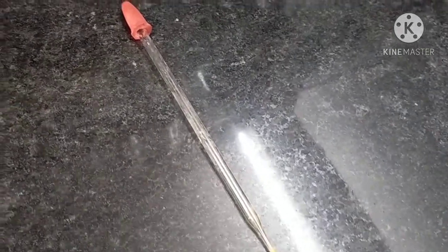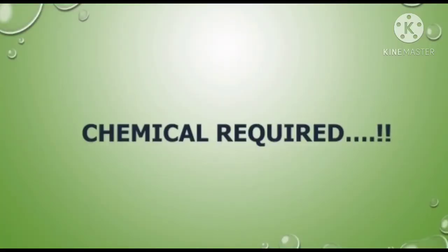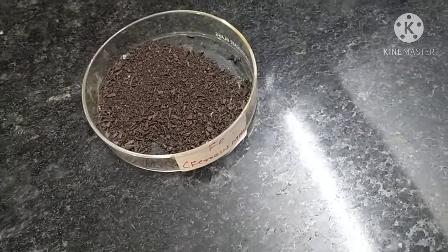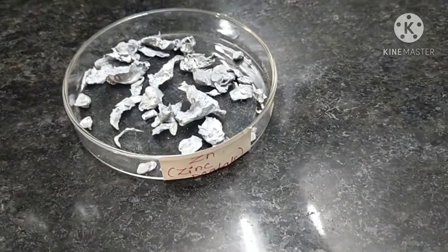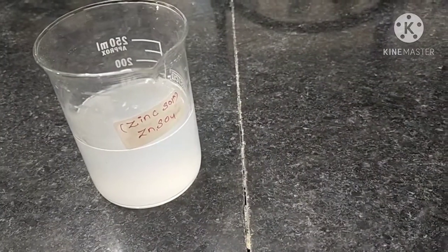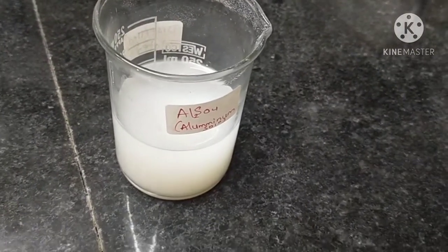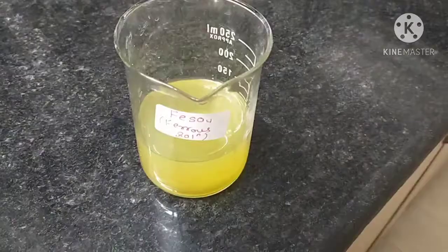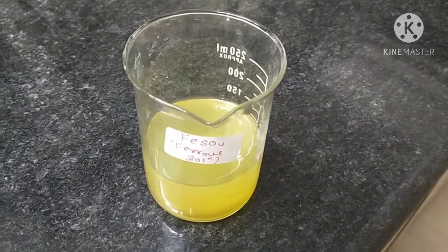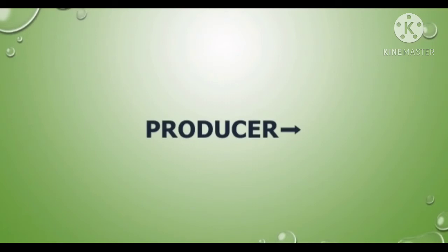To perform this experiment, the apparatus required are test tubes, a test tube stand, one beaker, a dropper, and one petri dish. The chemicals and metals required are iron metal, copper metal, zinc metal, zinc sulfate solution, aluminum sulfate solution, copper sulfate solution, and ferrous sulfate solution.